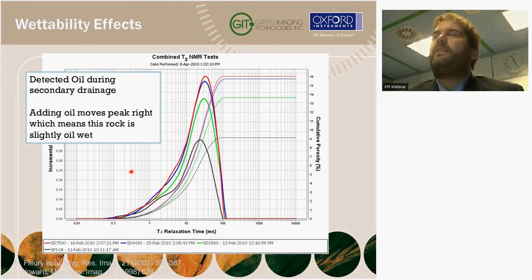So what is deuterium oxide? Well, it's just regular water, but the hydrogen happens to have an extra neutron. What does that do for us? From our perspective, that particular type of hydrogen gives us no signal, so the hydrogen becomes invisible. So in the experiment with D2O, deuterium oxide, we won't see the water, we'll only see the oil. So we're not overlapping peaks as I described earlier, we can only see the oil. So of course, everything is easier to interpret.